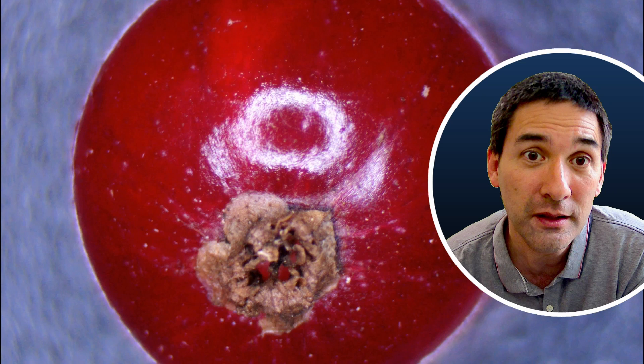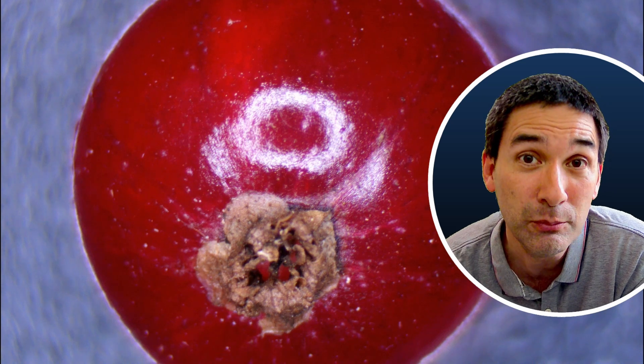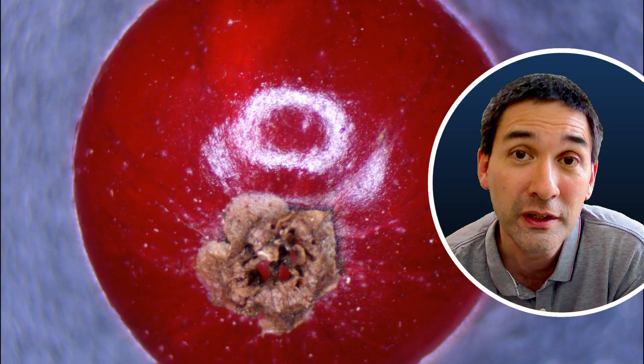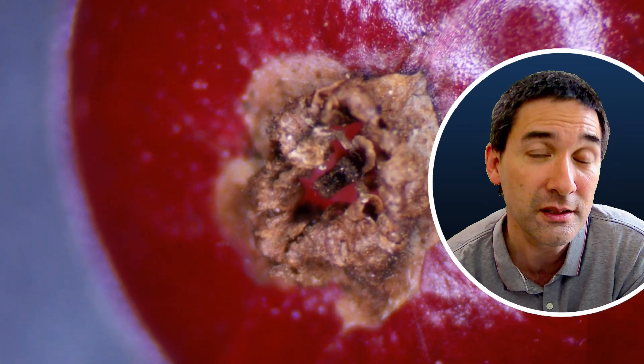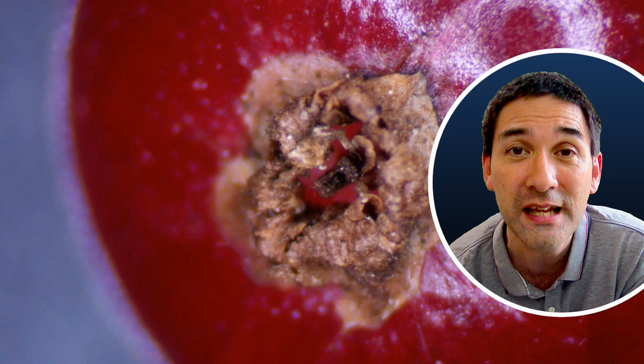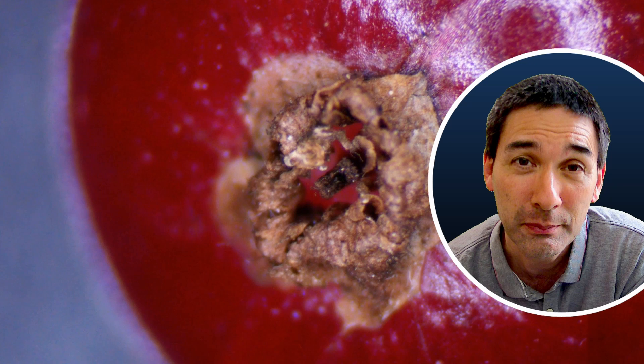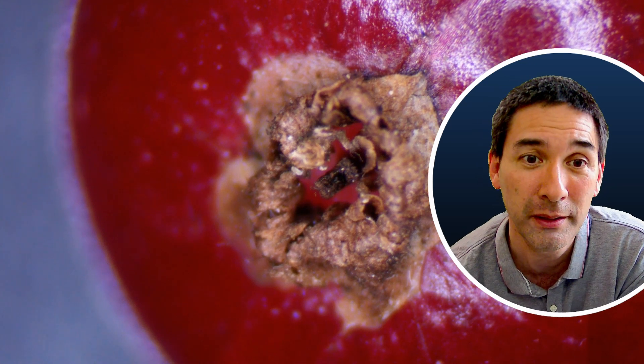The berries themselves seemed to be pretty unharmed by those mites. I've made videos about aphids before — those aphids actually did bite the leaves of the plant and caused some damage — but I did not see any damage here done by the mites.